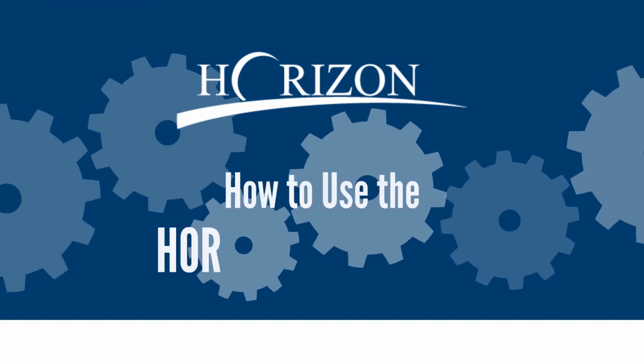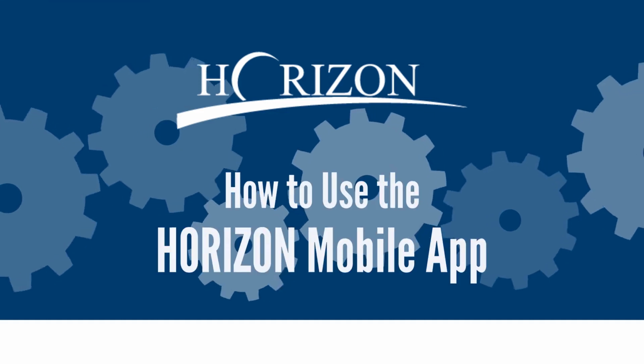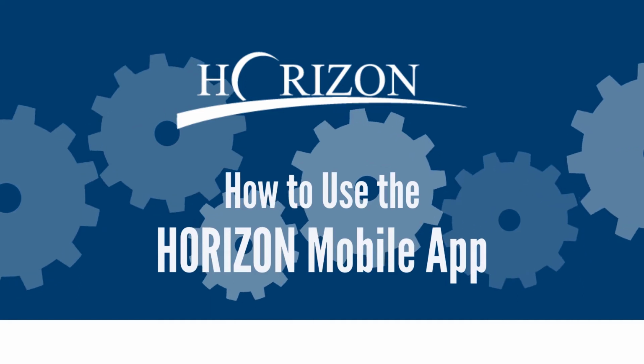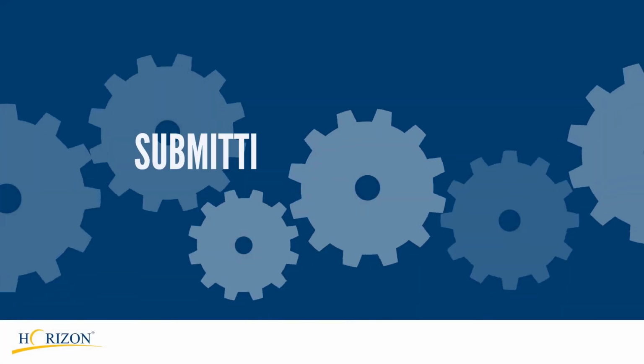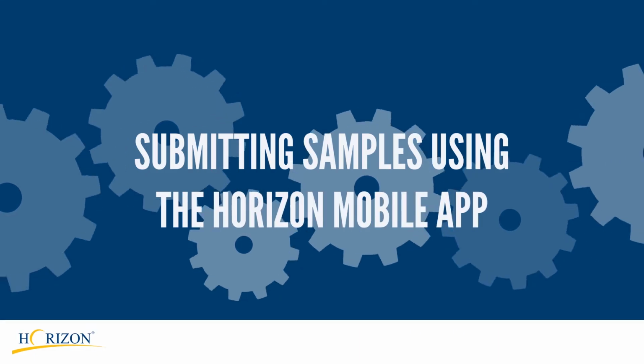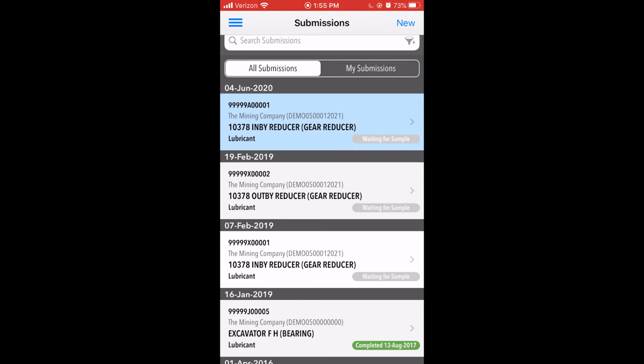This video will introduce you to the features of the Horizon mobile app so you can submit sample information and read report results wherever you are. Submitting and editing sample information via the Horizon mobile app is convenient, quick, and easy, and eliminates handwritten paperwork errors.